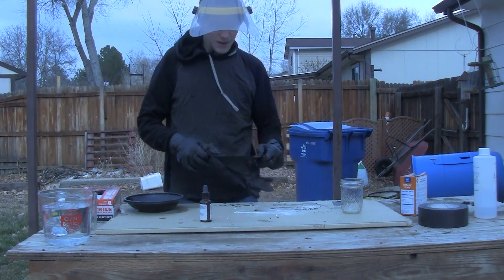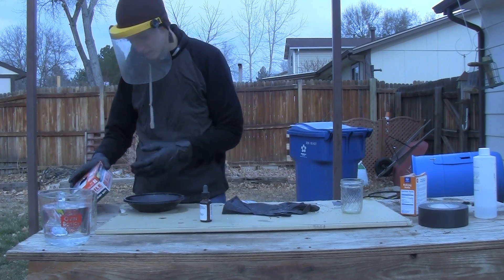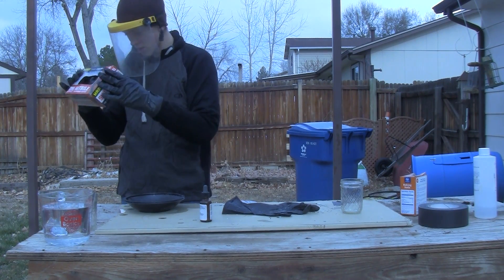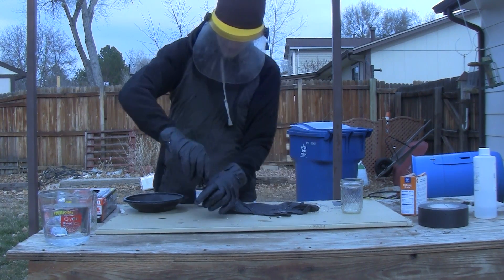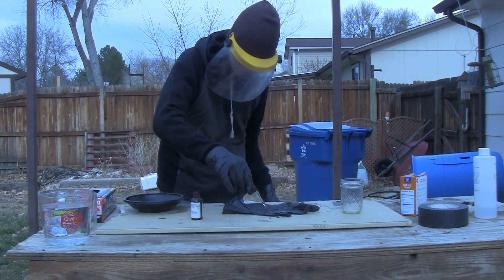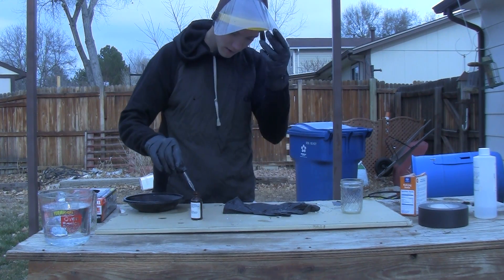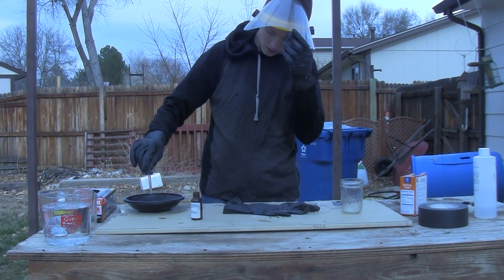This glove has a few holes in it — not the best. On the box it says that it can withstand up to 50% sulfuric acid. Now I'm going to take some of my pure sulfuric acid and see what happens.